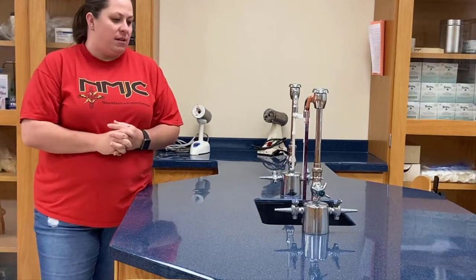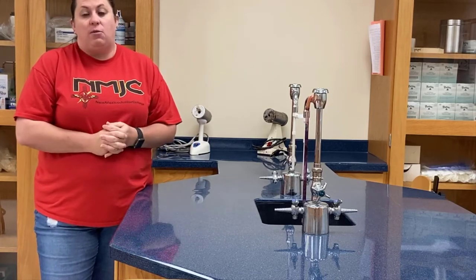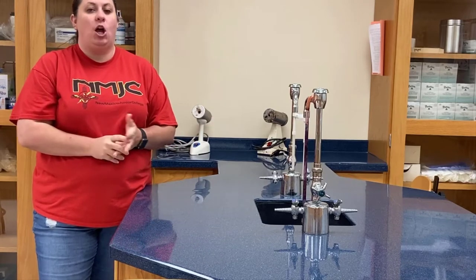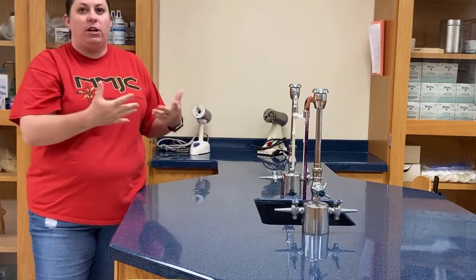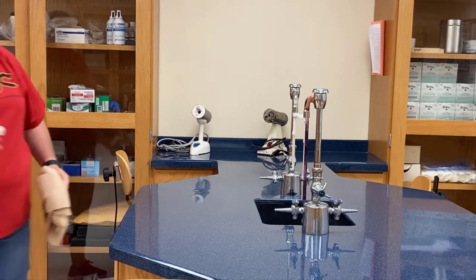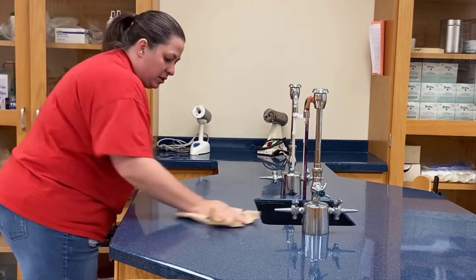When we get to the micro lab, there are a couple of things that need to be done before we can actually start with experiments. One of these is making sure that our lab space is fully clean. What we're going to do first is disinfect the actual surface, and we're going to do this with a type of bleach — we're going to spray and disinfect our work surface.